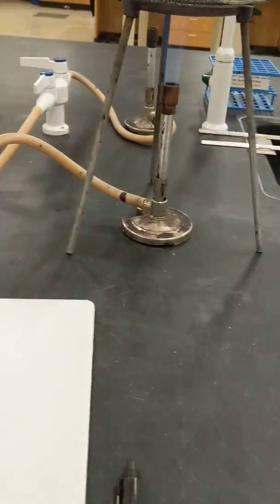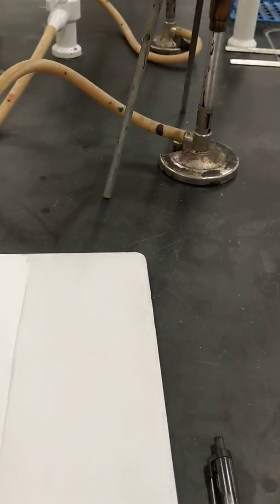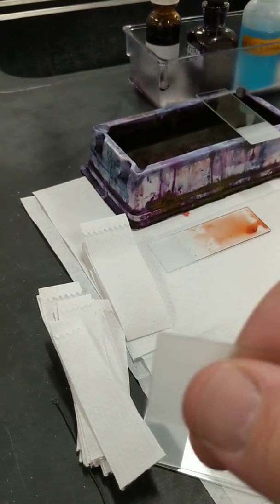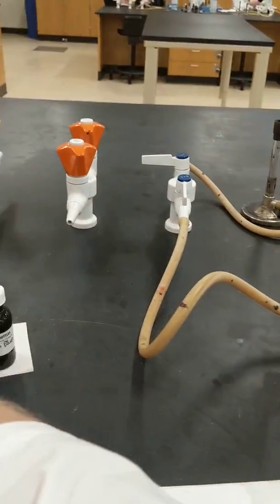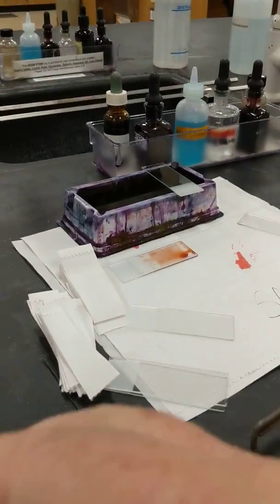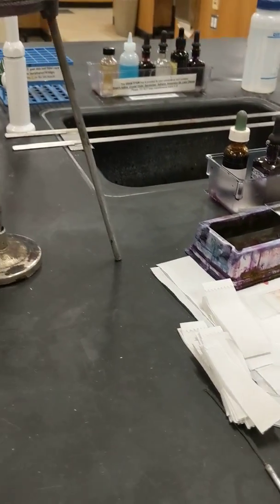Okay, I'm going to go over really quick what we're going to be doing, which is a capsule stain. With this capsule stain, what you're going to do is take your slide. I recommend having the fuzzy part of the slide on top, and you're going to take some Congo red and drop it on your slide.